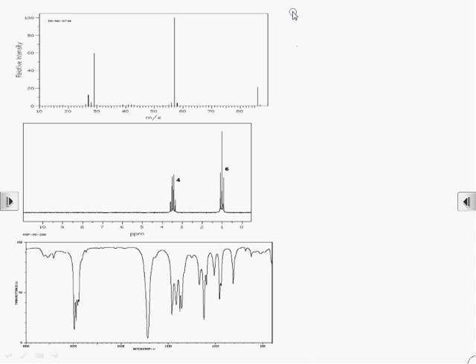Here we're using infrared and mass spectrometry and NMR in order to solve the identity of an unknown molecule. There's an order to how we could approach this.